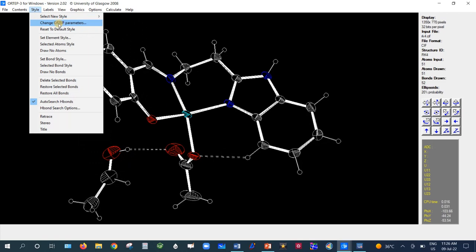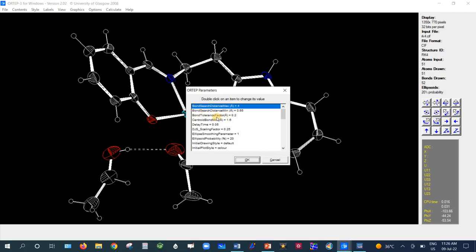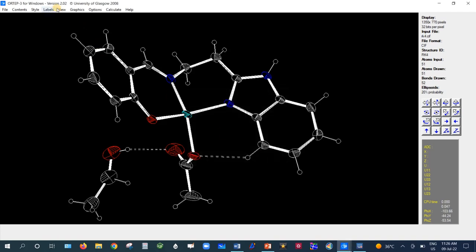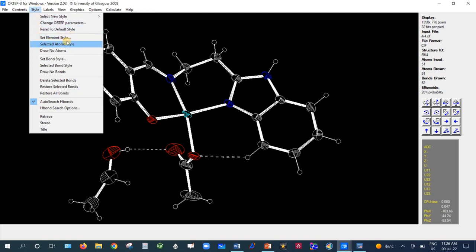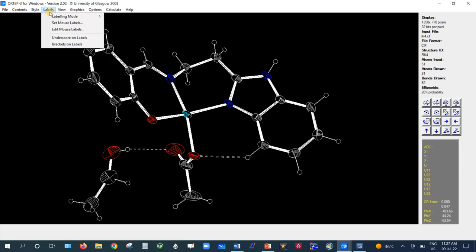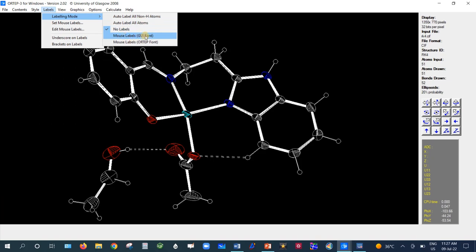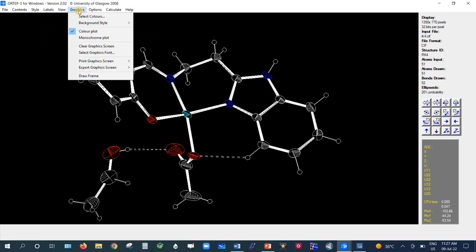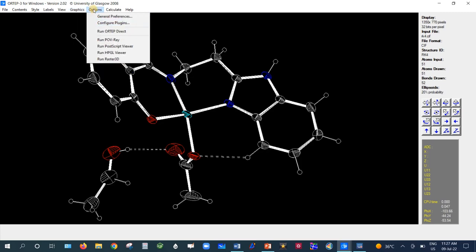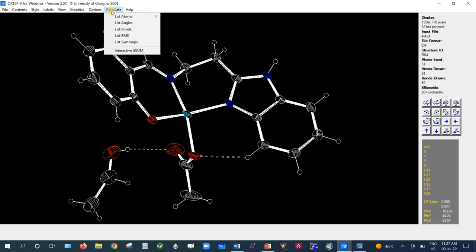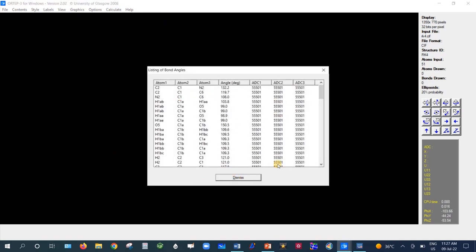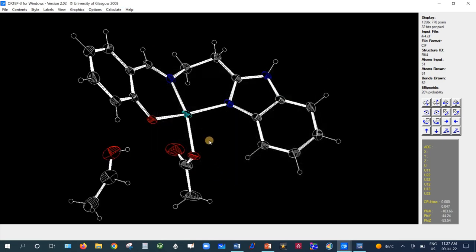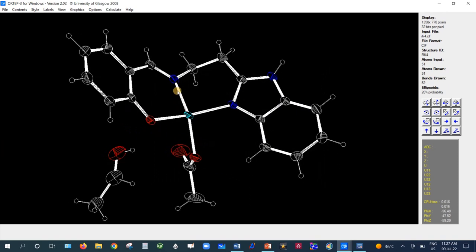There is a Change OTAB Parameter option where you can modify parameters such as bond distance and bond search distance. If you need a bond at a distance greater than a certain threshold, just edit the value — for example, 4.5 or 5.0 Å. Set Element Style and Set Atom Style are also available here, as is Set Bond Style. Under Labels, the best option is Mouse Label with GUI Font. You can also view along different axes, and change the background color or style under Graphics. Under Calculate, you can list bond distances and bond angles.